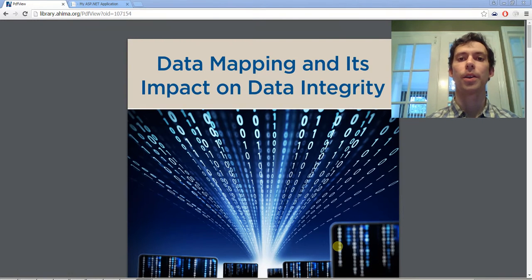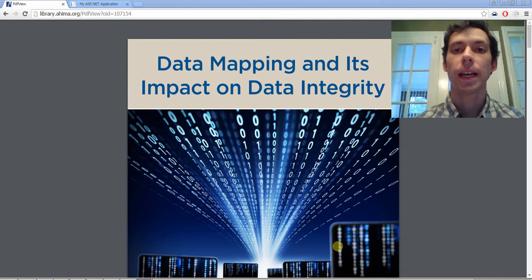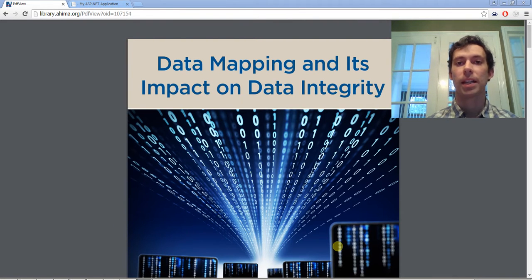Welcome to this video on the standardization of laboratory identifiers. A laboratory identifier is, in common sense, just the name. So hemoglobin is the name of a laboratory test. We're talking about standardization because in a healthcare network like the VA, for instance, there are many separate laboratories and each of them has different names that they use for those tests. And so we'll be discussing how we standardize those tests.